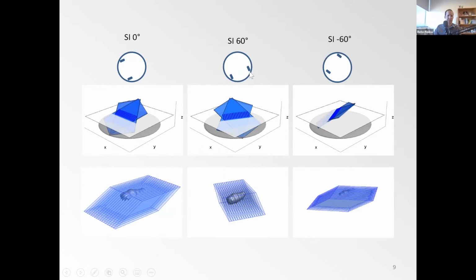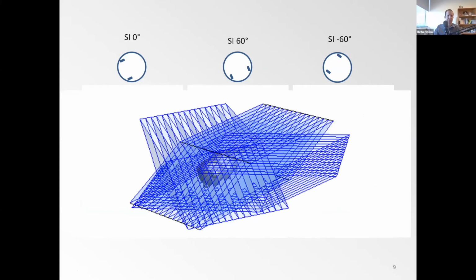Nothing prevents us from placing these illumination intensity components in different orientations in the pupil, and as such create oblique light sheets that are azimuthally rotated. So in principle, we can acquire volumes under different orientations of the pattern and then fuse that data together where they have mutual overlap and perform SIM reconstruction in the Gustafsson sense.